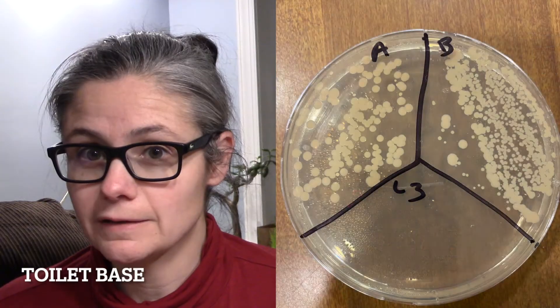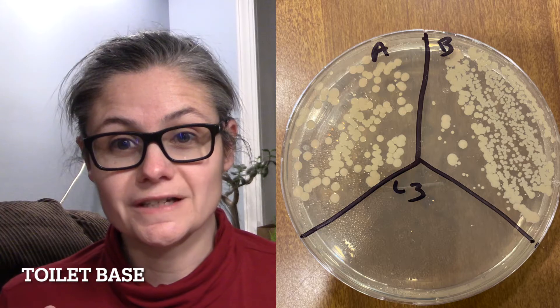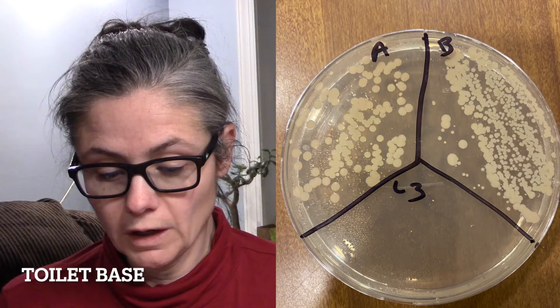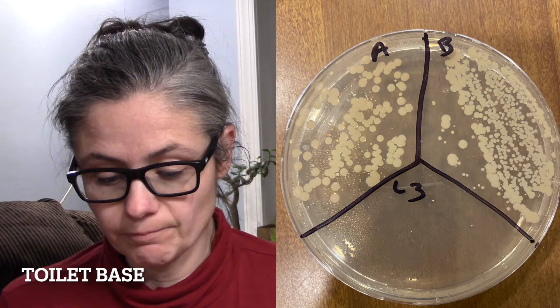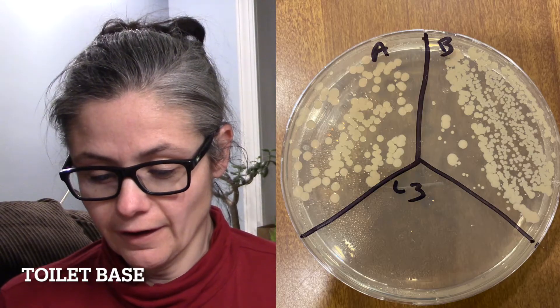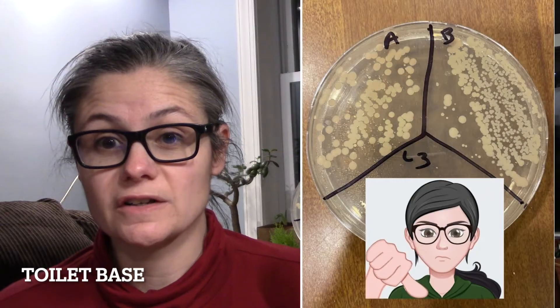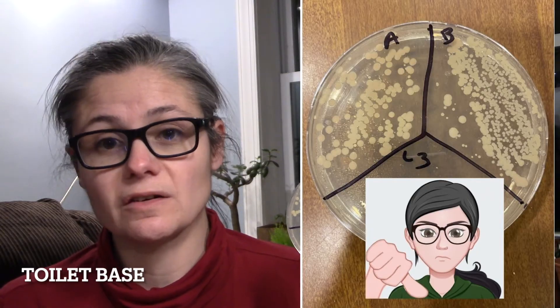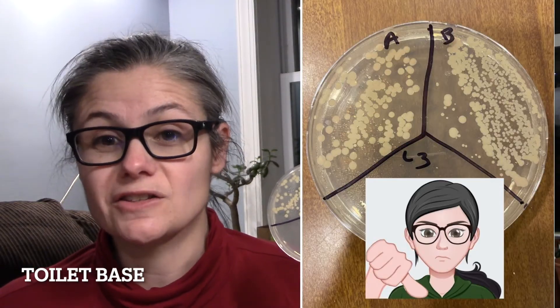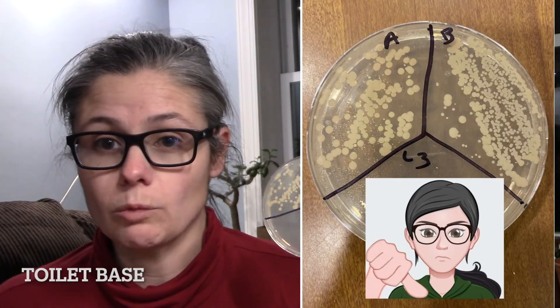The toilet base. This is interesting. In before, we see some small, medium, and large-sized colonies. And then after, I'm seeing medium and large size still present. So I would say Dr. Bronner's disinfects and kills some types of bacteria on my toilet base, but most certainly not all. I wouldn't say it's a super effective disinfectant for the toilet base.